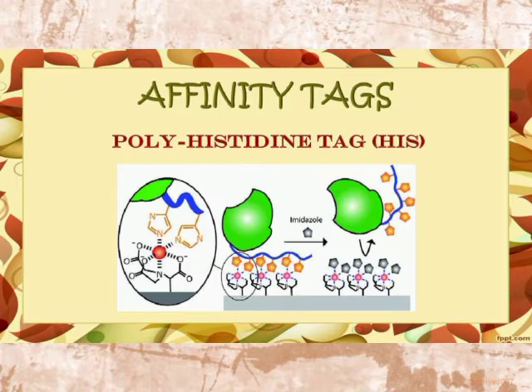So first I will be discussing the hexahistidine tag or 6X histidine tag. Hexahistidine tags are one of the most widely used affinity tags, and they utilize the ability of histidine to coordinate with transition metal ions such as nickel, copper, and basically they are small in size, non-toxic and do not interfere with the immunogenicity or physicochemical properties of the protein. And 6X histidine, basically this tag comprises 6 to 8 histidine residues. That is why it is also known as 6X histidine tag.